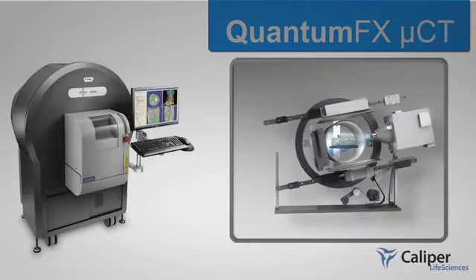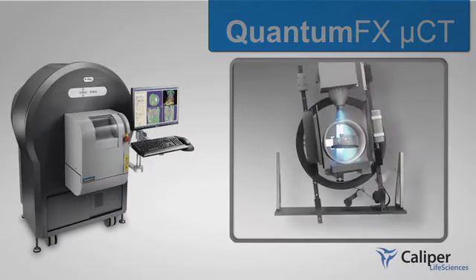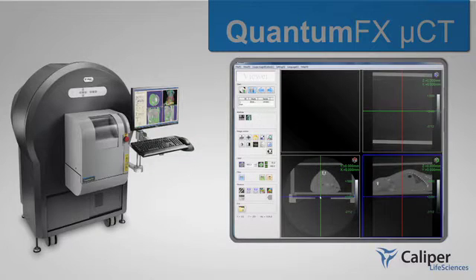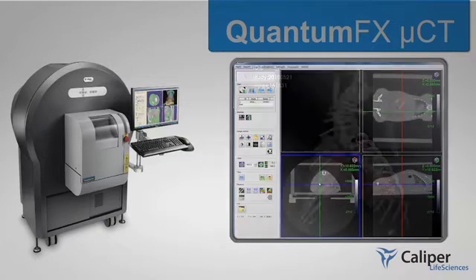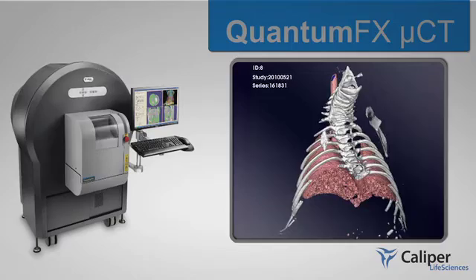Boost your throughput and revolutionize your preclinical imaging platform with high-quality data using the QuantumFX microCT system from Caliper Life Sciences.